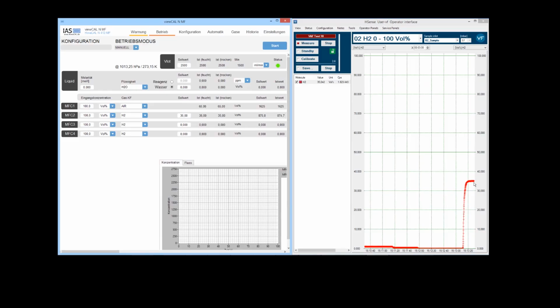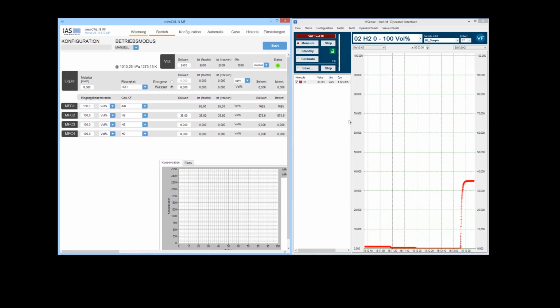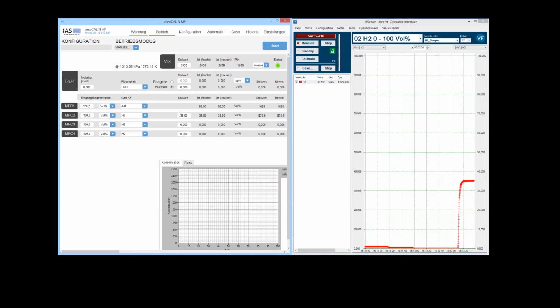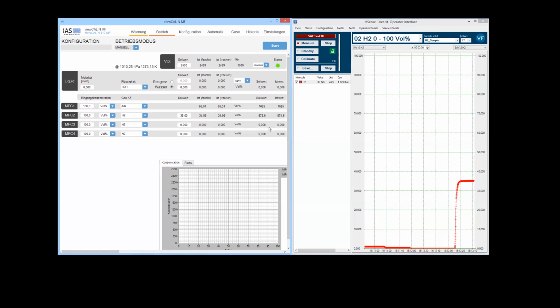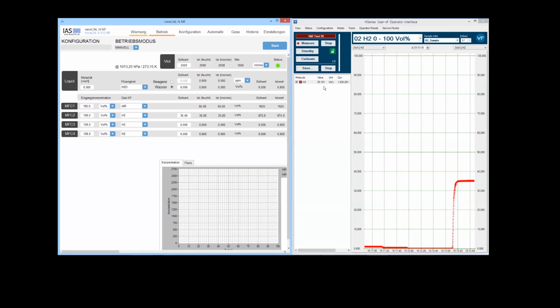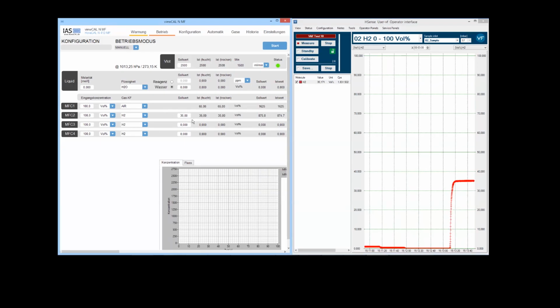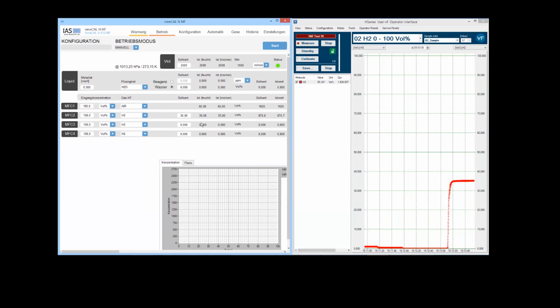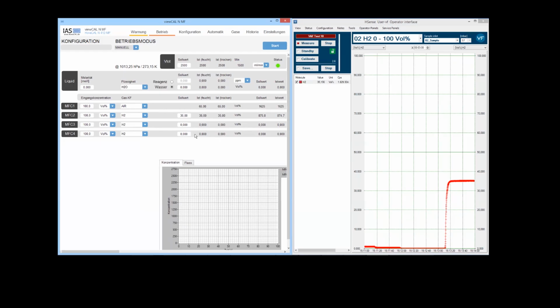And in order to get a statistical estimation of that, you would save these data, then evaluate the reading of the instrument, and then compare it to the set concentration. So usually you build the difference between set concentration and measured concentration, and then scale that with the set concentration in order to get a percentile value. And that should be below 2% for these kinds of instruments.